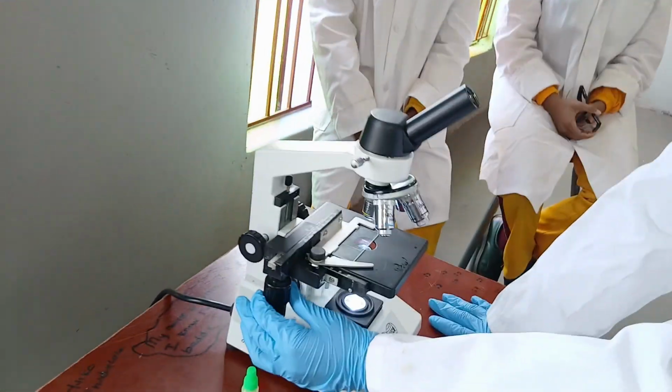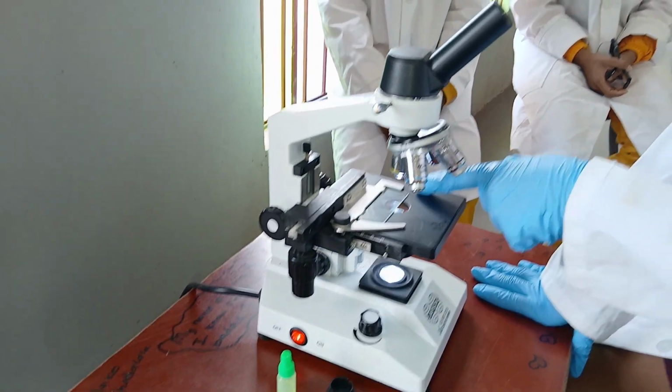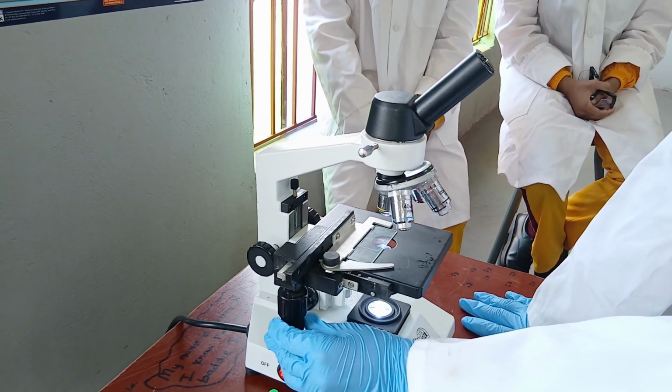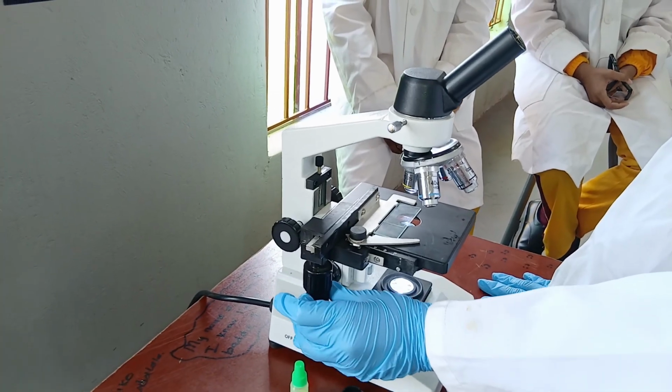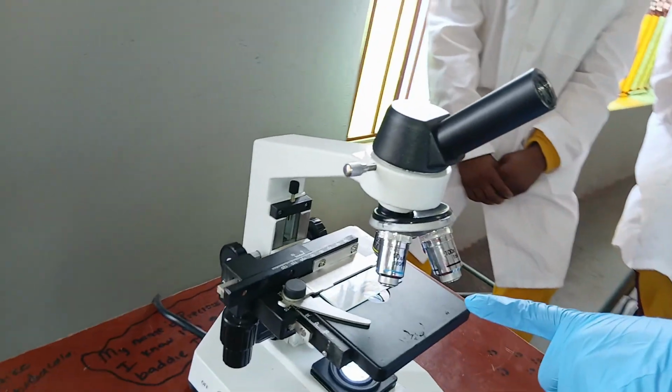We also have our X-axis knob, which is used to adjust the slide forward and backwards for clarity, as well as our Y-axis knob, which is used to adjust our slide left and right to see the microorganism more clearly.